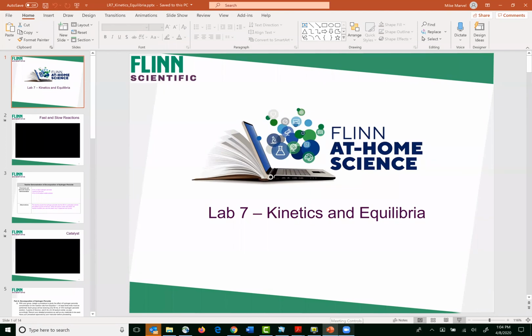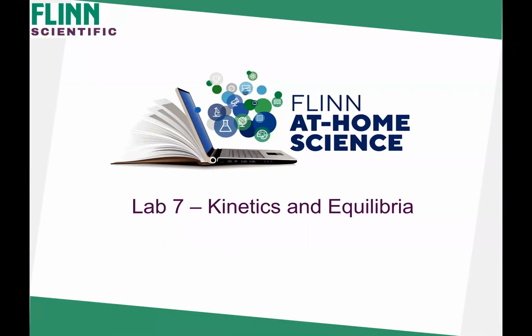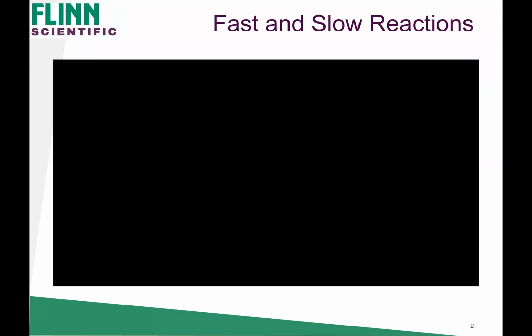This is something that's really near and dear to my heart. Kinetics and equilibria, we can look around the natural world and find examples of these things everywhere. Kinetics is really about how fast or slow reactions happen. I want to just start out, instead of me talking about it, just show you a quick video to delineate the difference between something that's fast and something that's slow. We can then, from there, get into the experiment.